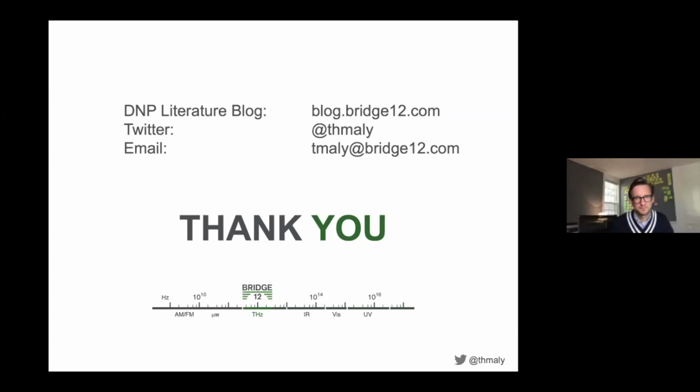Right. And then our next question comes from Kong, saying, great talk. You mentioned that it is important to measure T1 and T2 of the electron. Can you describe how your setup measures them specifically? And secondly, is it possible to use the field modulation technique plus a lock-in amplifier for EPR detection at high field? So I didn't go into these details. The way we set up these systems, CW detection is always possible. That is basically the simplest detection. You use field modulation, as in standard EPR. You can either sweep the microwave frequency, or if you throw in a small coil, you sweep the additional coil, and then you use a lock-in amplifier to pull the signal out of the noise. That always works.